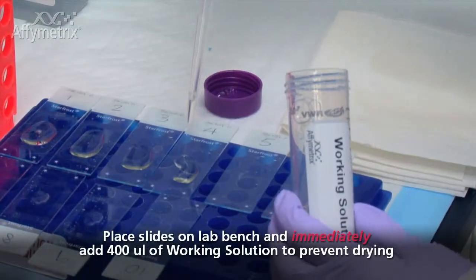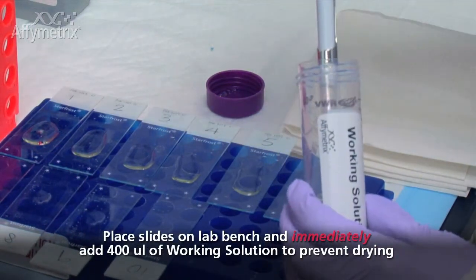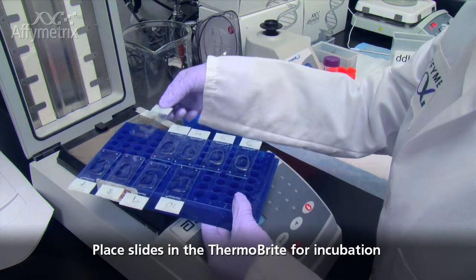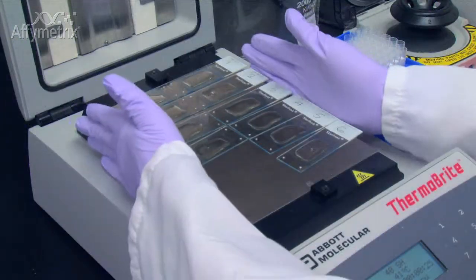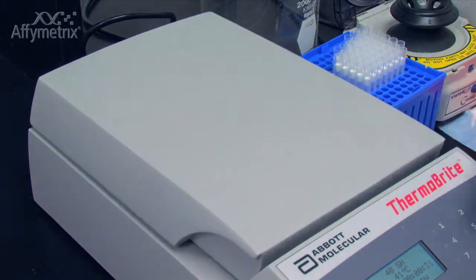Place the slides flat, face-up on the lab bench and immediately add 400 microliters of working solution onto the tissue section. It is also helpful to place the slides on a tube rack, then add the reagents. This will make it easier to transfer the slides over to the Thermobrite. After adding working reagents to all the slides, carefully place them in the Thermobrite and close the lid for incubation.